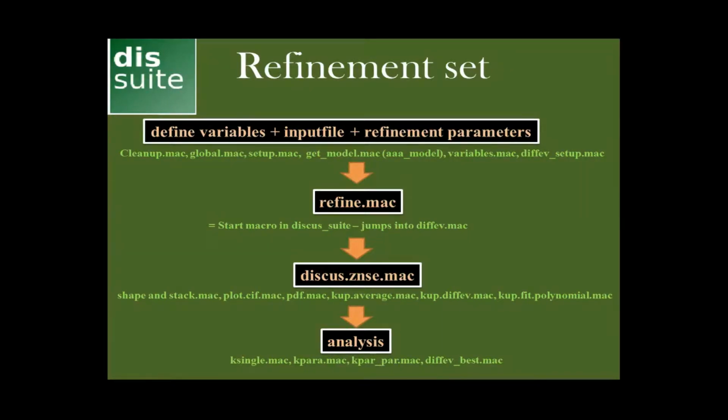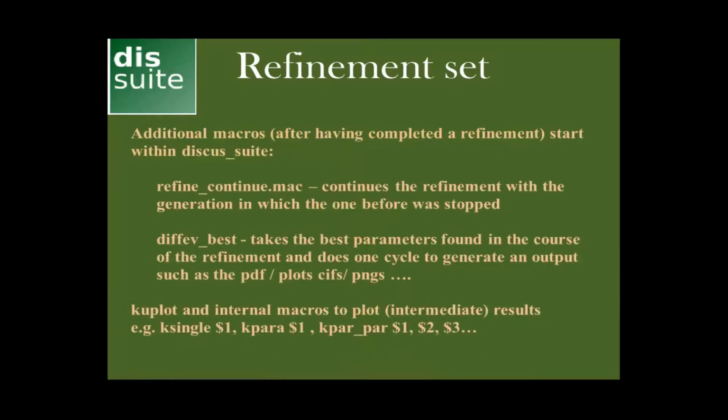And there are a few macros in the folder which just deal with the analysis of the data. You theoretically could delete them and it wouldn't change the outcome of the refinement, but it's actually useful to have them concentrated in a folder.